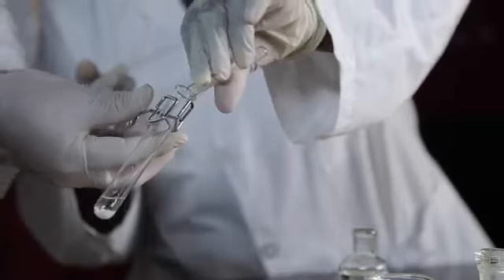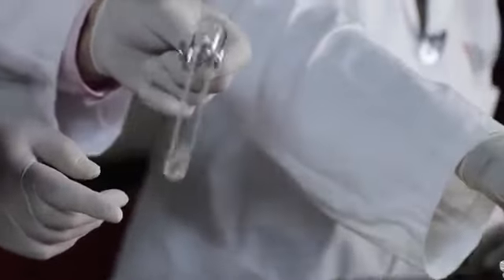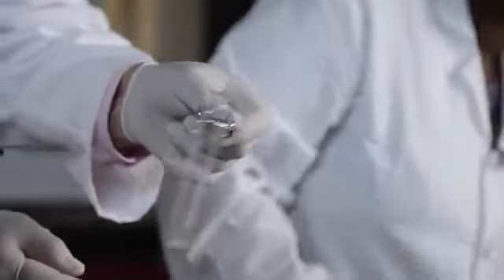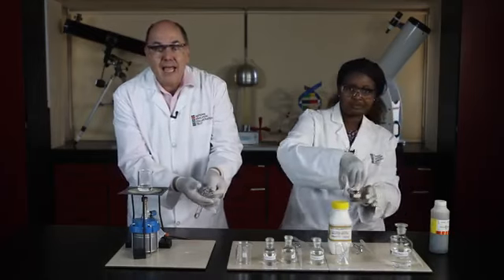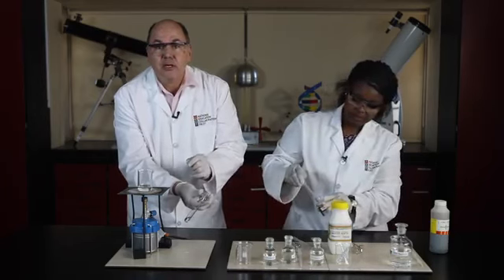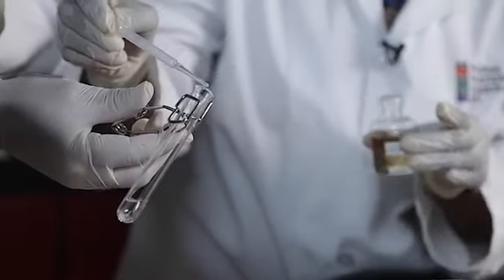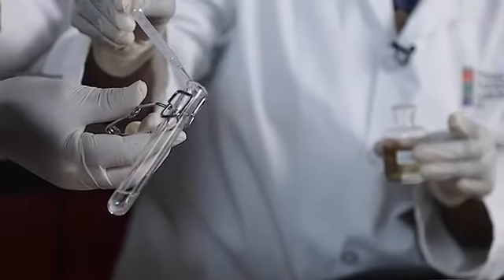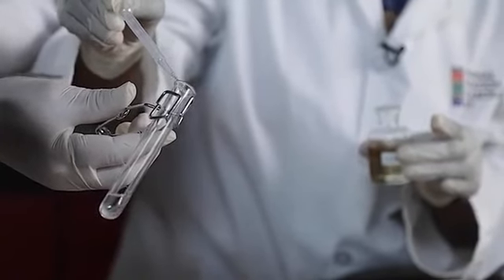You'll see that the acid hasn't totally dissolved, but I'm swirling it, more or less dissolved. What shall we do next, Joyce? Finally, we add the catalyst. We carefully add a few drops of concentrated sulfuric acid to the mixture, dripping it down the sides of the test tube. Here we go. One drop, two drops, and another one to make sure everything reacts.